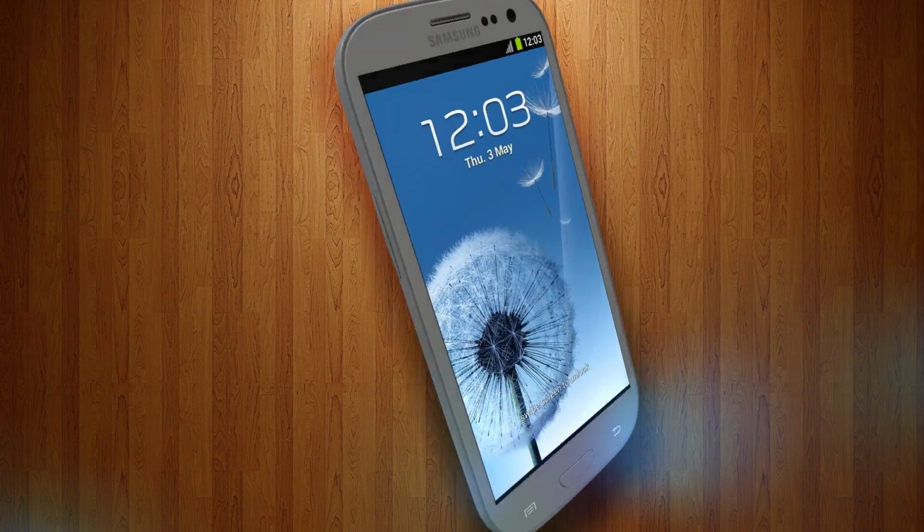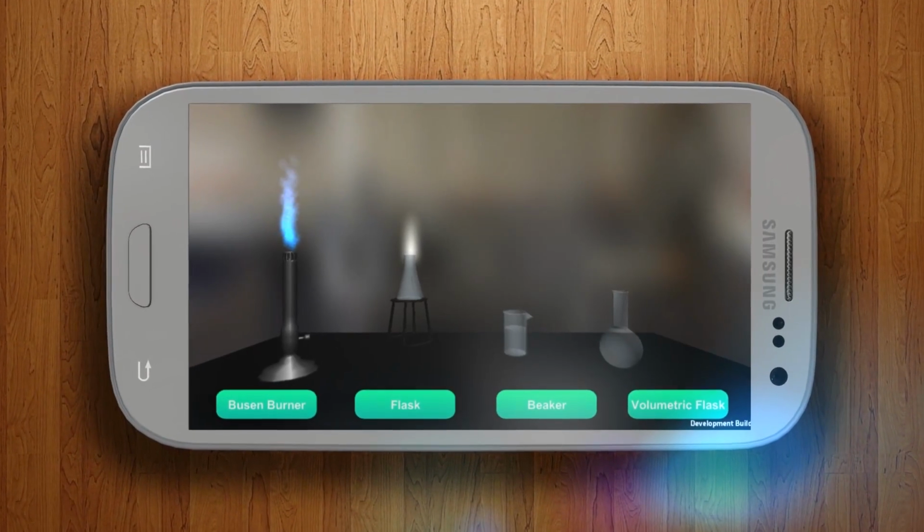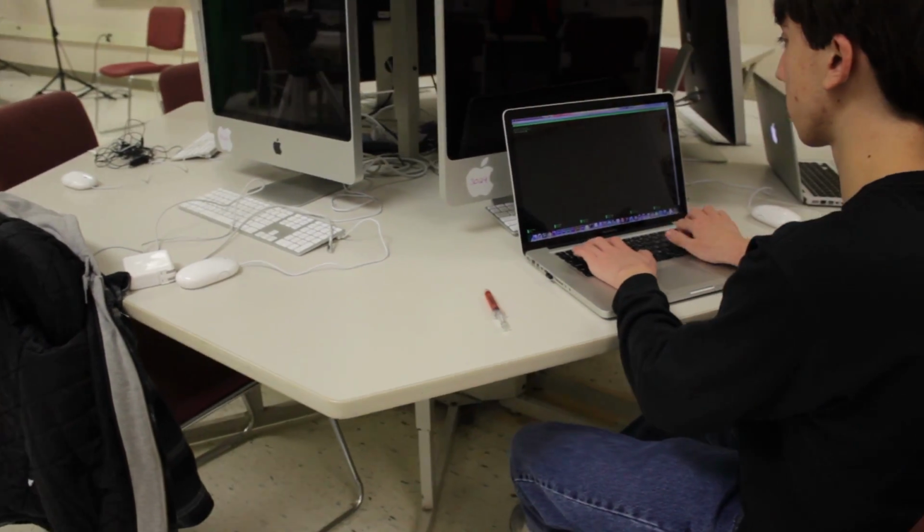Introducing Tactillium, a virtual chemistry lab for mobile platforms, which will allow students to simulate chemical reactions in a virtual environment. To prove that this idea is plausible, we actually created a working prototype of the app. Here's how we did it.